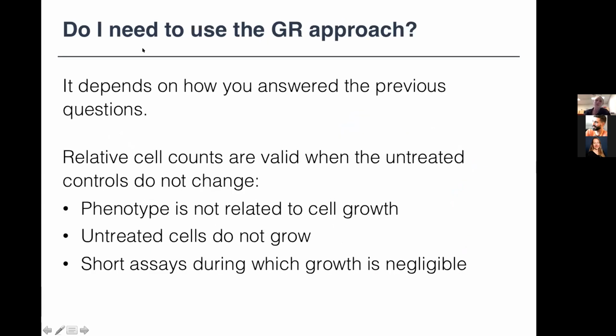And so the final question that is also important is, do you actually need to use the GR approach? And that really depends on how you answer the previous questions. So it's not always required or recommended, but there are certain cases when it really is critical.